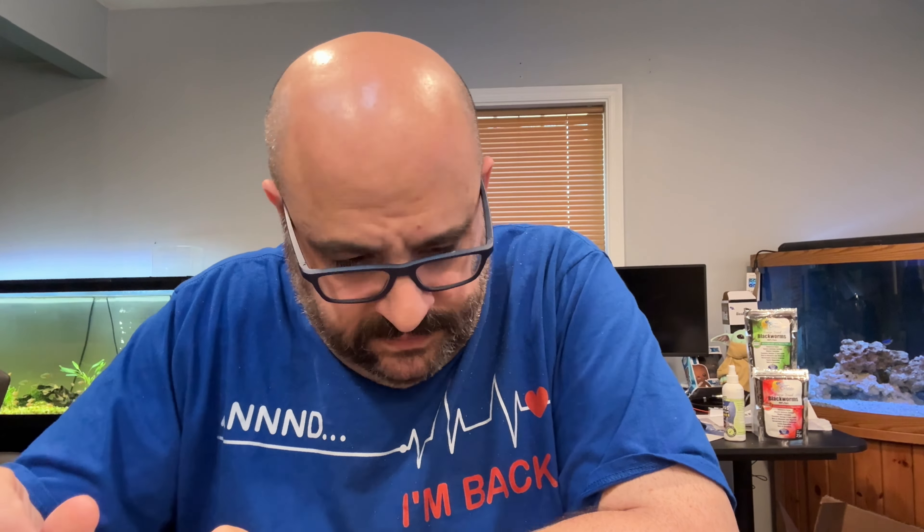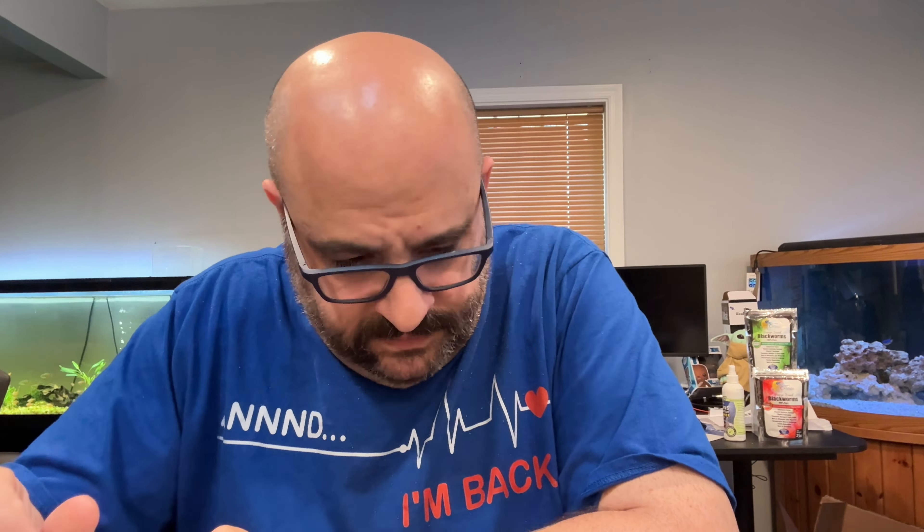The Fritz kit comes with four glass tubes, similar to the API test tubes. They have the five-milliliter line and a foam case. The liquid tests included are two solutions for ammonia, one for nitrite, one for nitrate, and one wide-range pH. One thing I already like about this kit is that it works for salt water as well.